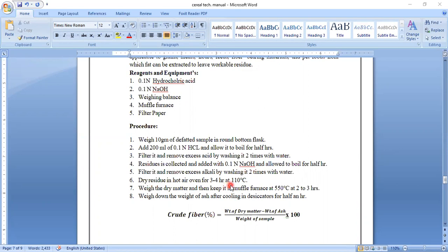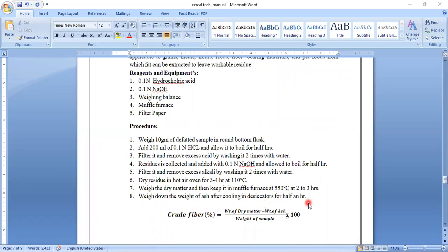Once washing has been completed, dry the residue in a hot air oven for three to four hours at about 110 degrees Celsius. Weigh the dry matter and then keep it in the muffle furnace. The muffle furnace is used for finding out the ash content as well as the crude fiber content, and it is operated at a temperature of 550 degrees Celsius for two to three hours. Then weigh the ash after cooling in the desiccator for half an hour.